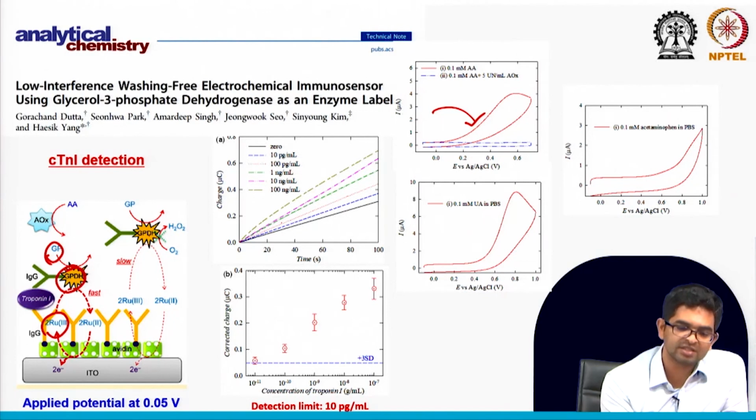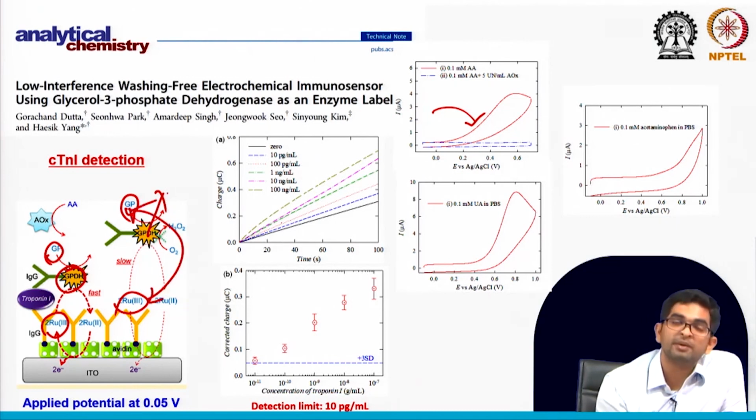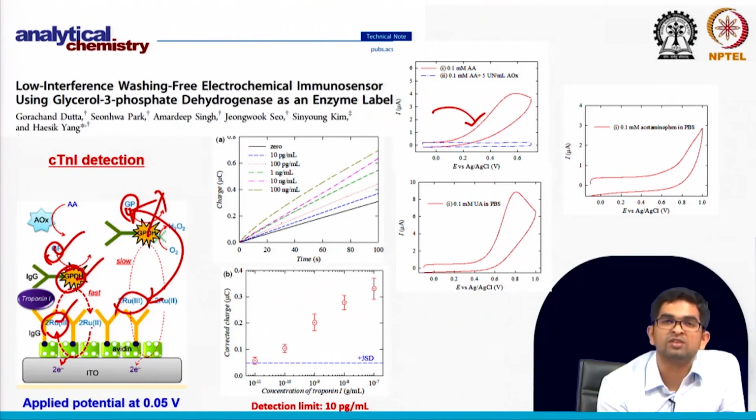If it is background, the glycerol phosphate dehydrogenase will be very far from the surface. So mainly your background signal will be because of GP and ruthenium. So GP and ruthenium are considered the background signal, and GP, GPDH, and ruthenium cause the actual signal in the presence of target.